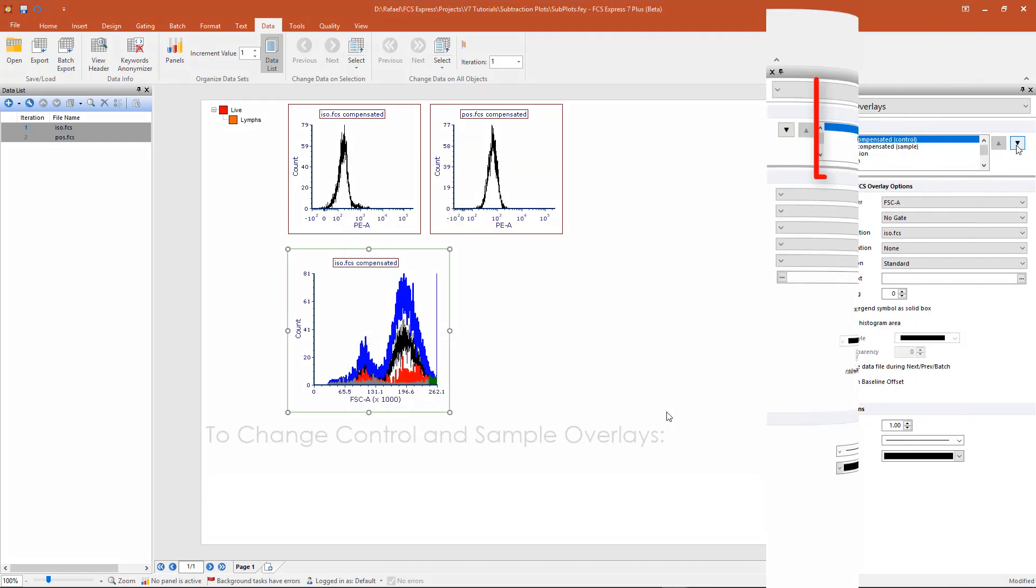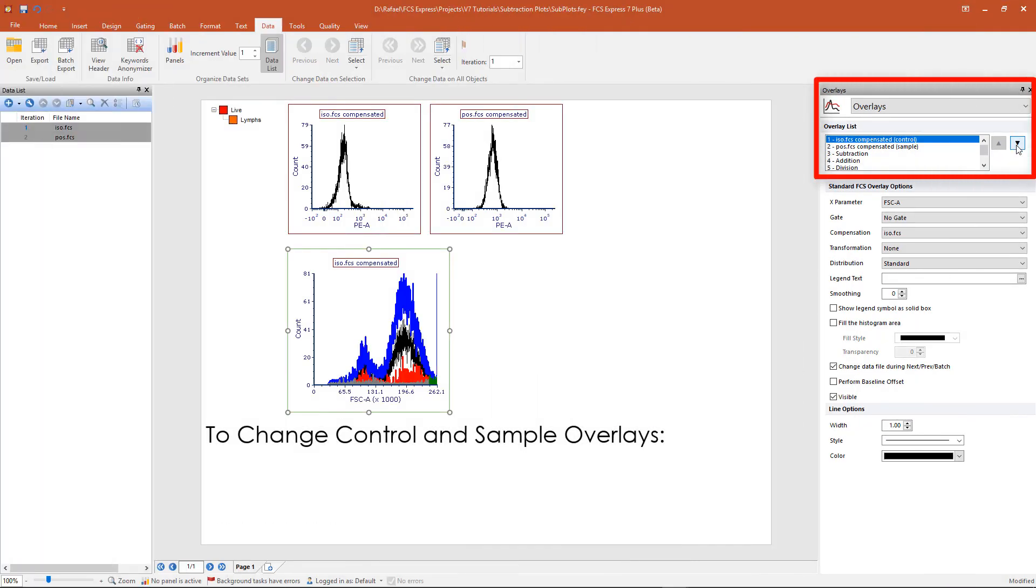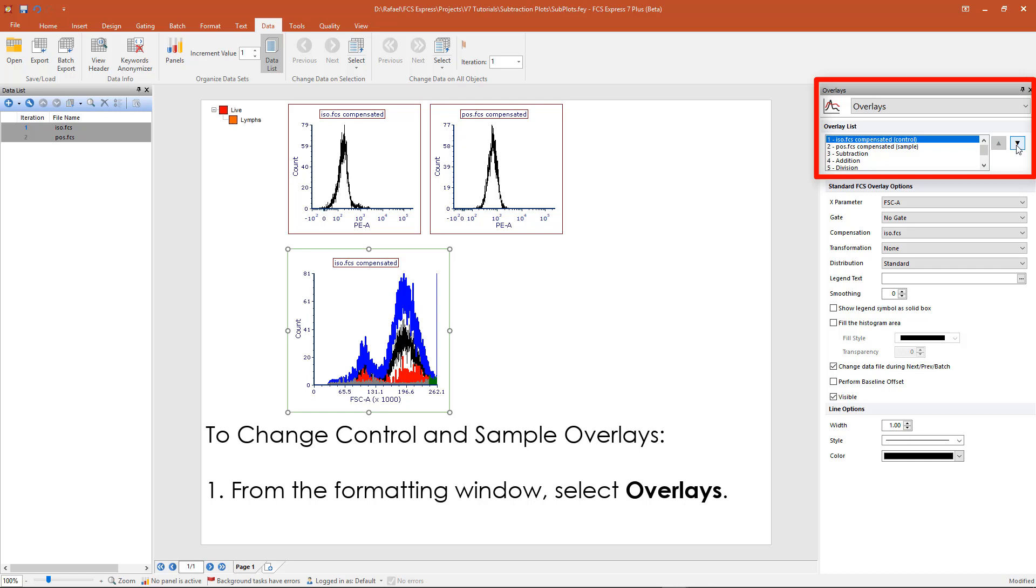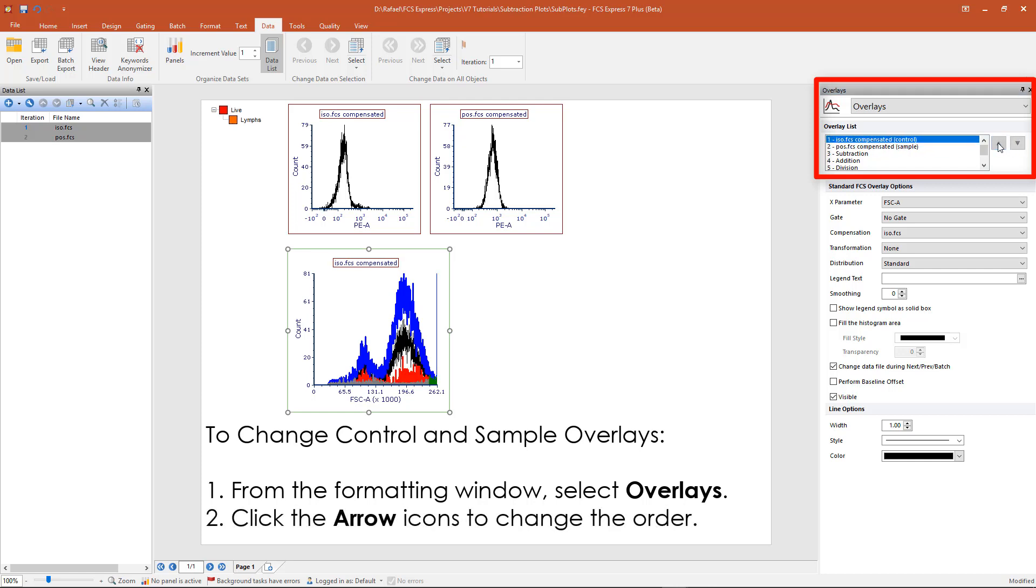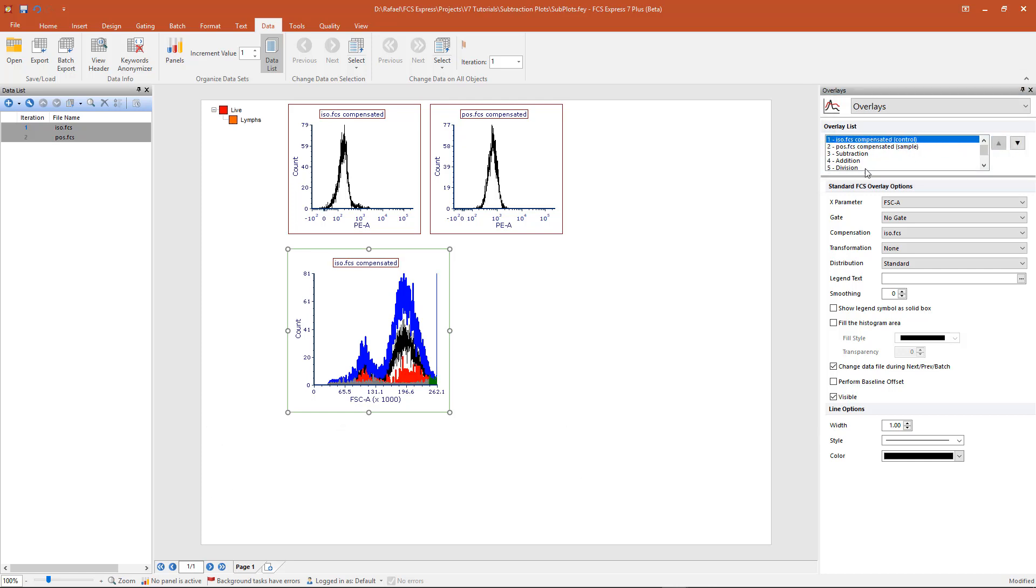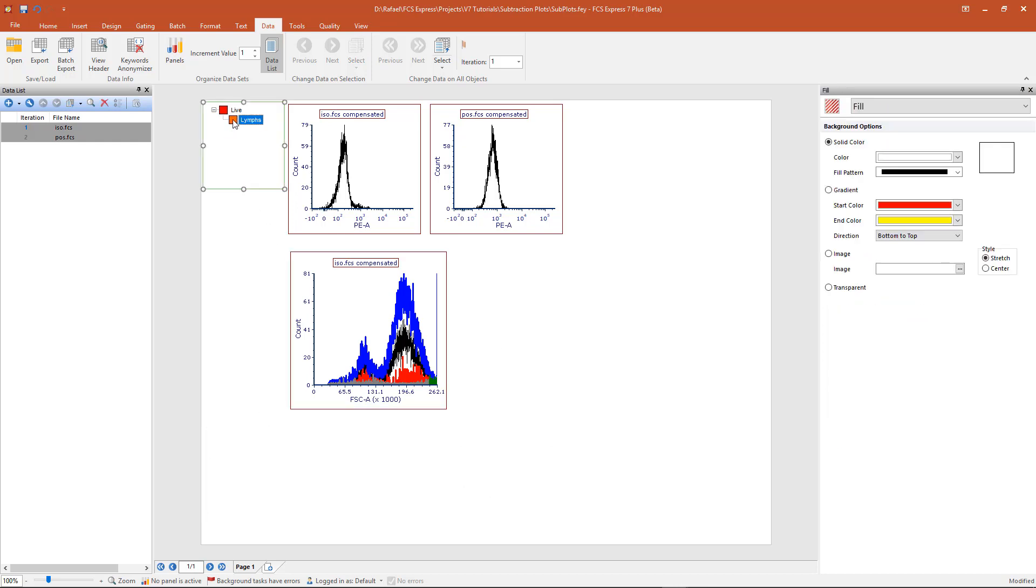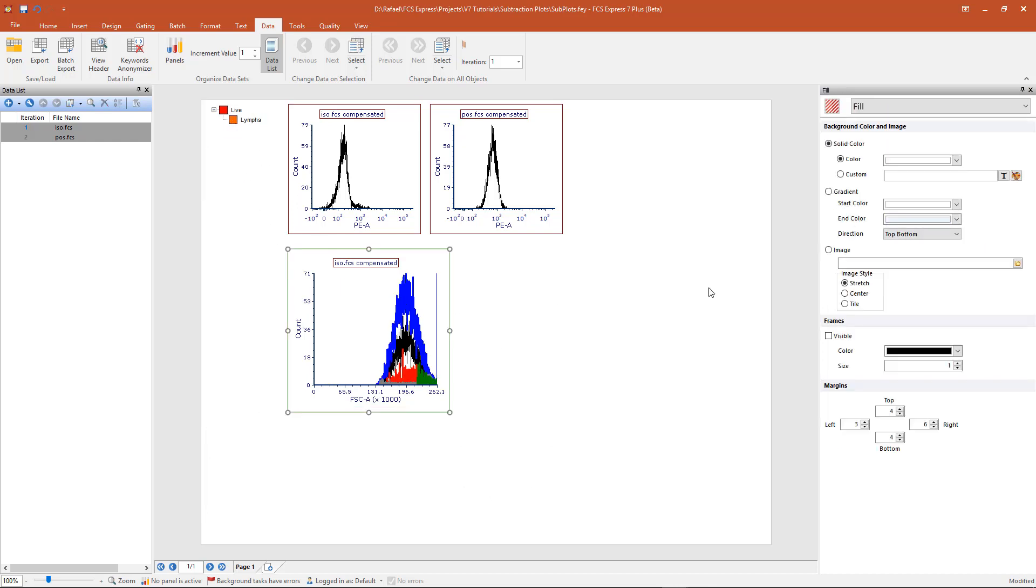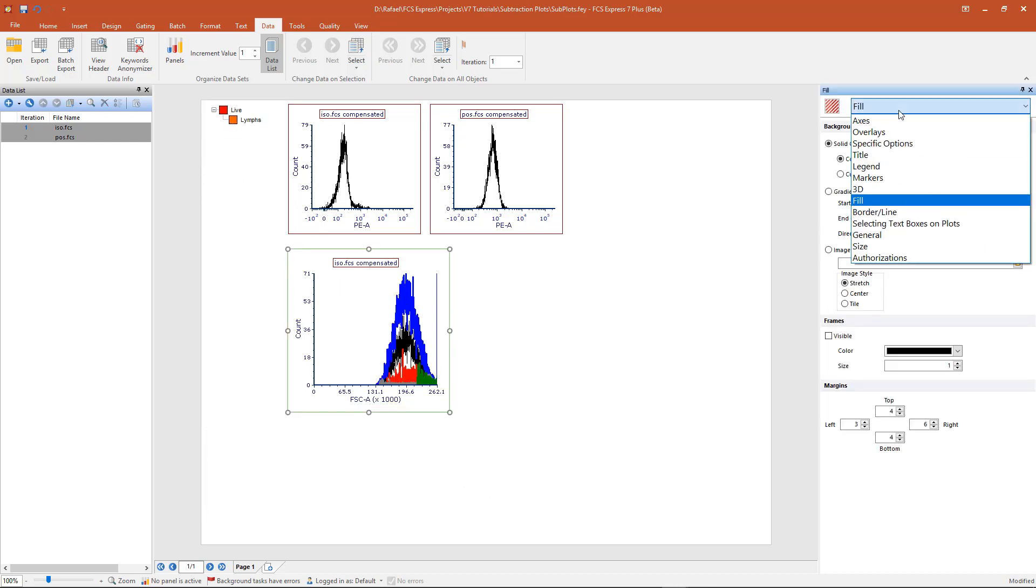The order of the overlays can be changed via the overlays category. Use the arrow keys to change the order of the overlays. Gates can be applied to subtraction plots by simple drag and drop. You may also change the parameters.